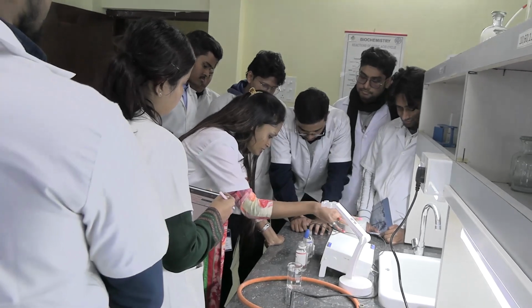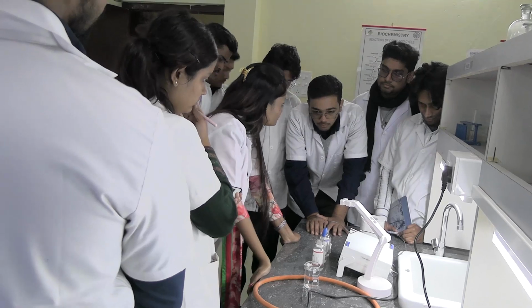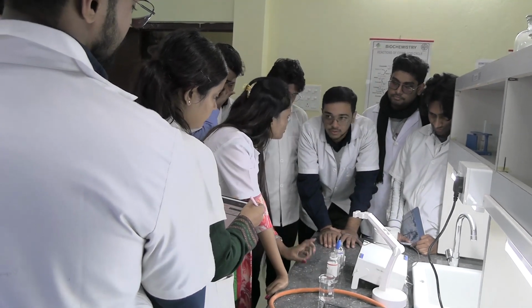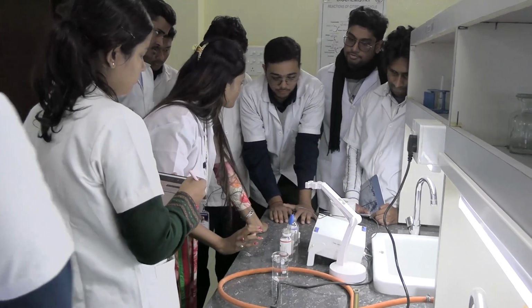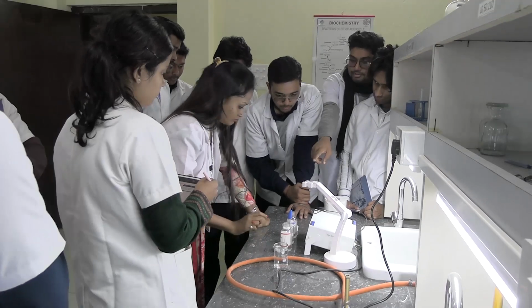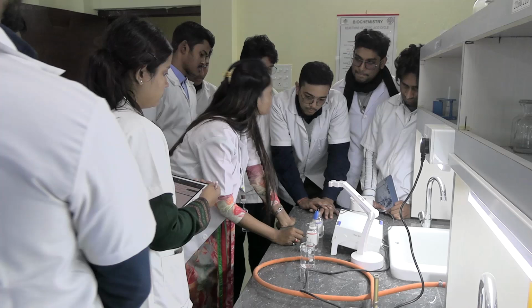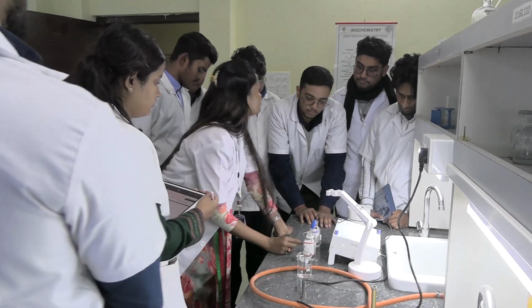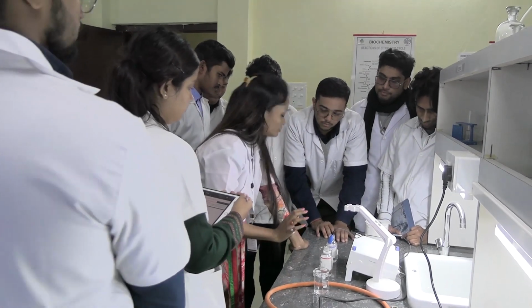So this is the purpose of setting the pH. There is no particular significance of pH 7 or pH 4 themselves. The purpose is to avoid error in the pH reading. So we are calibrating the pH meter, so that the unknown solution's pH reading doesn't change.